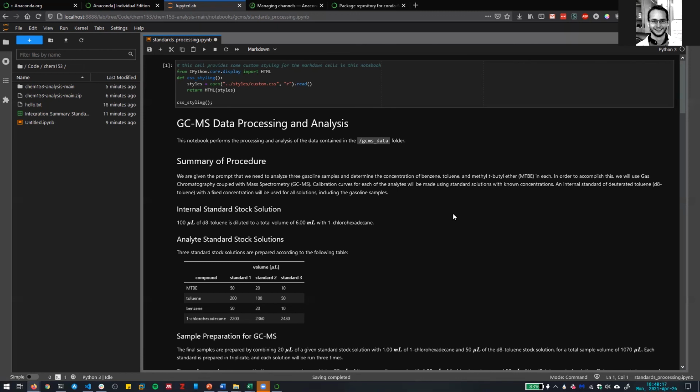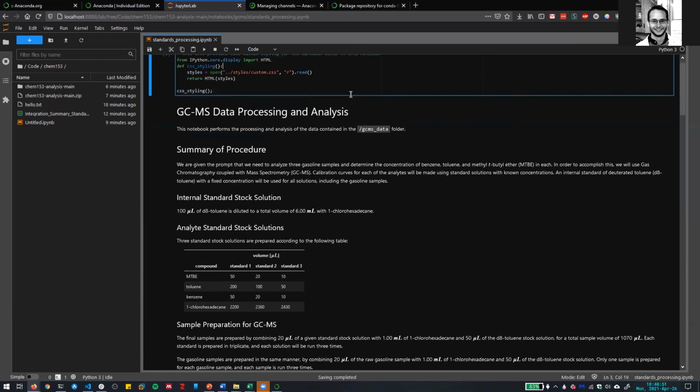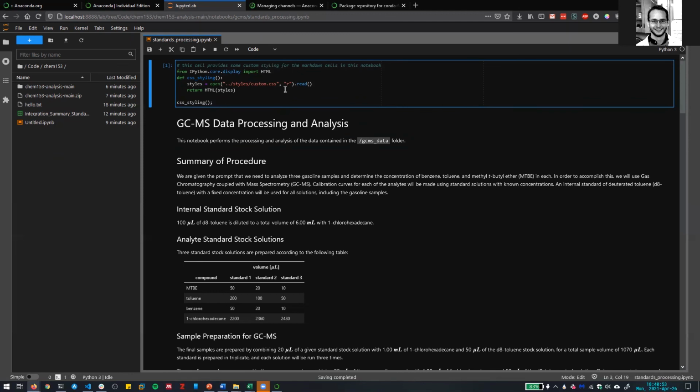And yeah, as I mentioned last Wednesday, our discussion this Wednesday is not going to go into a lot of detail about Python as a language itself. I would really recommend doing some work on your own, like I said, with those free resources to get a little bit familiar with the formatting and the syntax of Python, like defining what a function is and what imports do and things like that. If you have questions about this stuff on Wednesday, I'm happy to go over some of that. But if I spend a lot of time going over the basics of Python, then we won't get to the actual data analysis part.